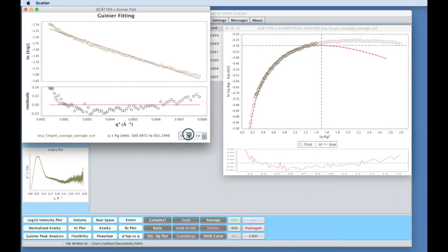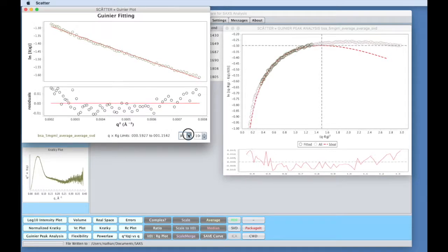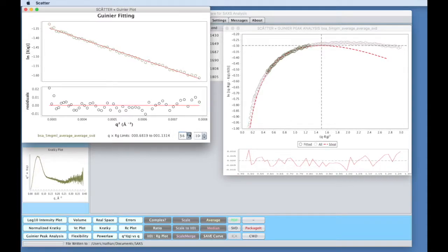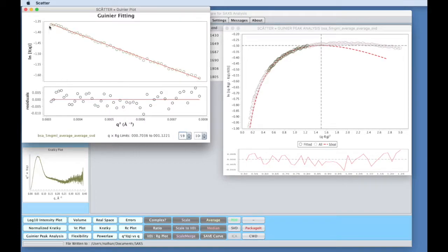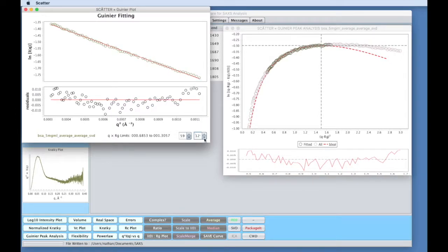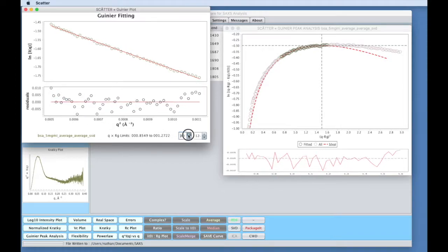So really what we should be doing is I cut from the small angle end. You can see we're actually getting closer and closer to the crosshairs here. And as I come out, because RG is dropping, this Q times RG limit is going down as well. So I'm going to put this back up to 1.3 like this. Now you can see actually we've still got a bit of a smile shape in the residuals here, so I'm just going to get rid of a few more points.